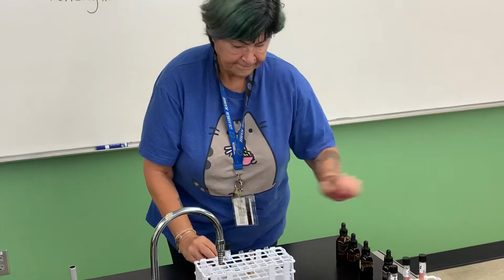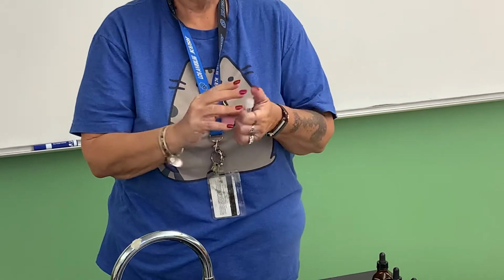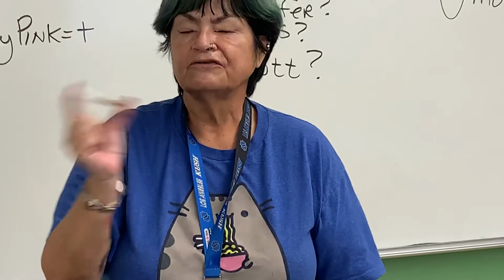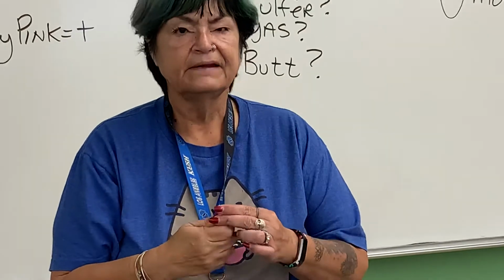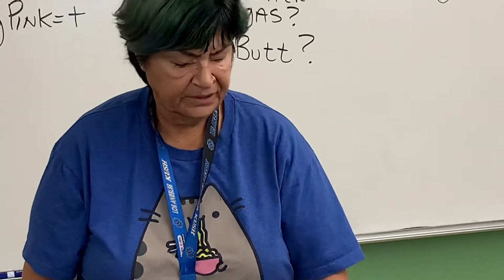Okay, I'm not going to sit here and shake it for a minute on camera, but I just want to show you, this is how you shake the V. You shake it really hard for a minute. After a minute, you're going to loosen the lid and wait 20 minutes. So let's see what happened.